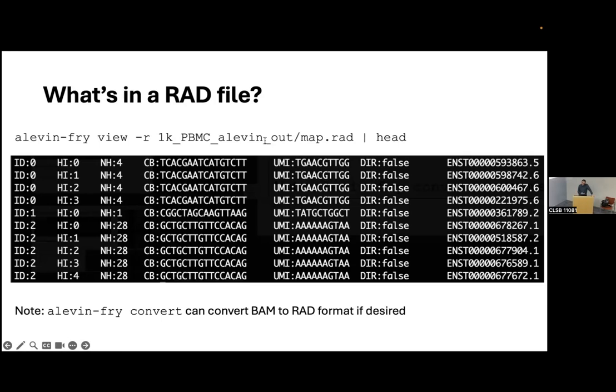Even if it overcounts, that's better than undercounting. If you have more data that you want to filter out later, that's okay in my book. We can set our filtering criteria in the downstream analysis stage to discriminate what we think is a real versus non-real cell, rather than using the upstream heuristic. So that is something that I often do, run these steps with an expectation. Then once we merge and deal with all the data, we can QC and filter out what is potentially noise or debris at that stage rather than this one.